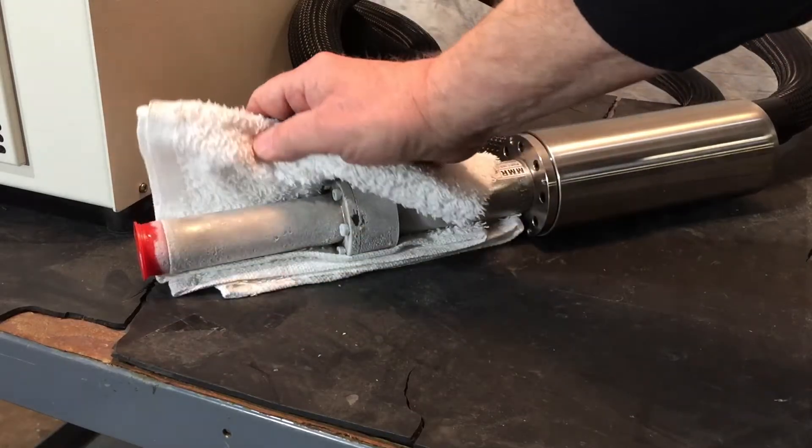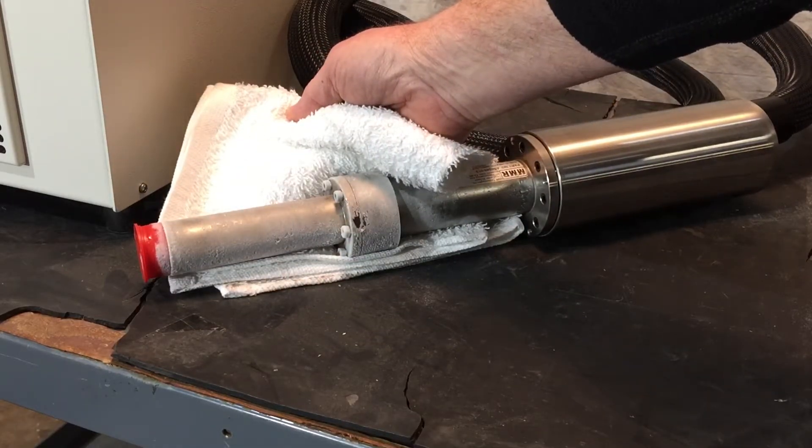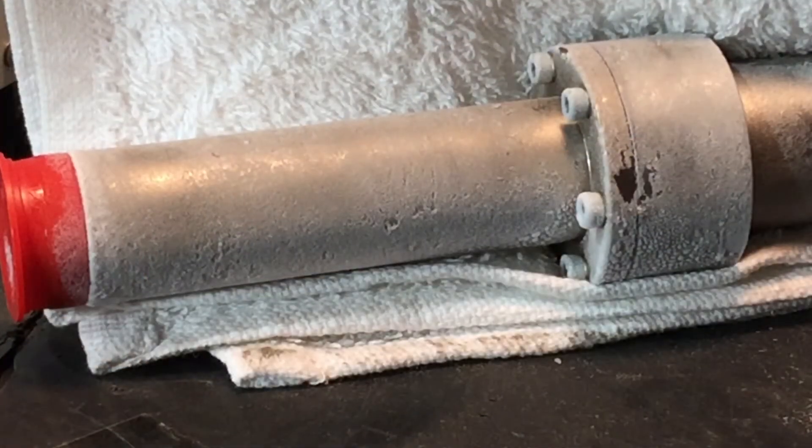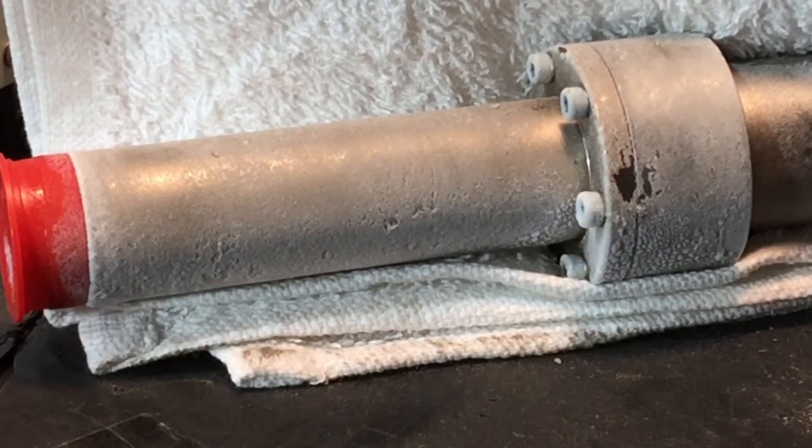After about an hour and a half, you can easily detect that the cold hood is well below room temperature. Depending on the size of your detector and the ambient temperature, it can take anywhere from 12 to 20 or more hours to be adequately cooled.